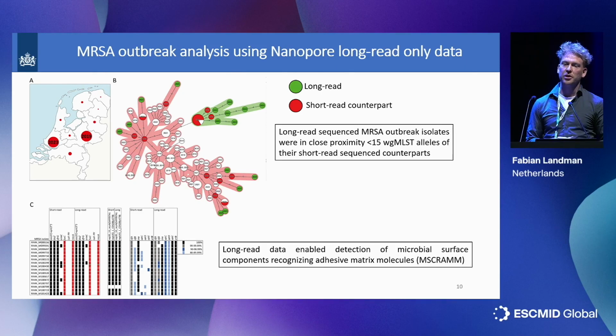It was a bit too short notice to include data on how well these assemblies looked. But we had a few figures, which I couldn't add, about the chromosomes, and in almost all cases, the chromosome is just one entire contig for the Nanopore data. So that looks amazing.